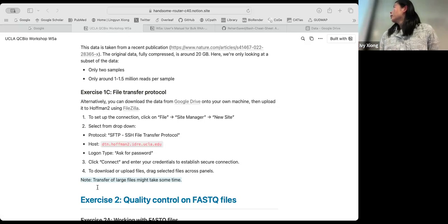So we are looking at this zip file, right? That's the output. And then we also have an HTML file. That's something we have to download to our own laptop, and then you open up a browser for the readout. So I'm going to open it up now. But for you, you might want to set up the file transfer first. So let's take some time to get FileZilla to work, because I do want everybody to be able to download and see it for yourself.